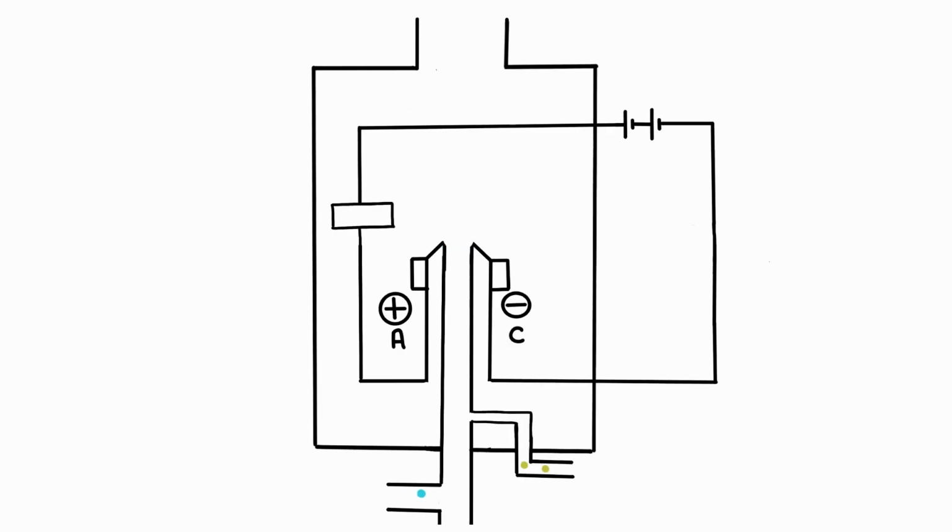Firstly, the formation of a flame is a result of the introduction of hydrogen and oxygen gases from the inlets located at the bottom of the detector. As long as these gases are being introduced, the flame can be maintained. One end of this flame acts as a cathode and the other end acts as an anode.